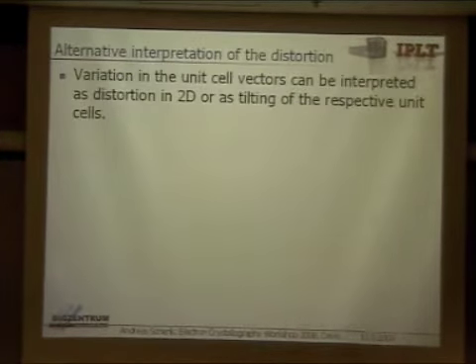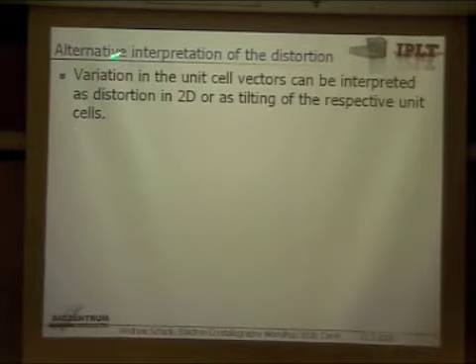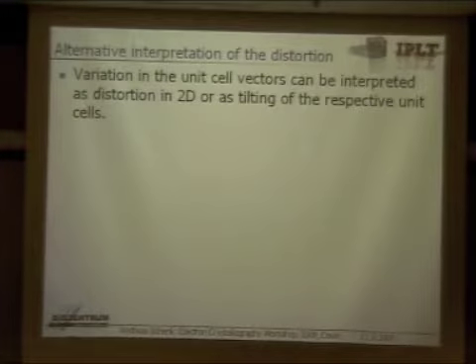So there's a second thing I thought of. This came to my mind when we were working on a project on outer membrane porin: that perhaps this distortion is not really 2D. You showed that crystals are not flat, and in your group Philip is working on that, doing some particle analysis.